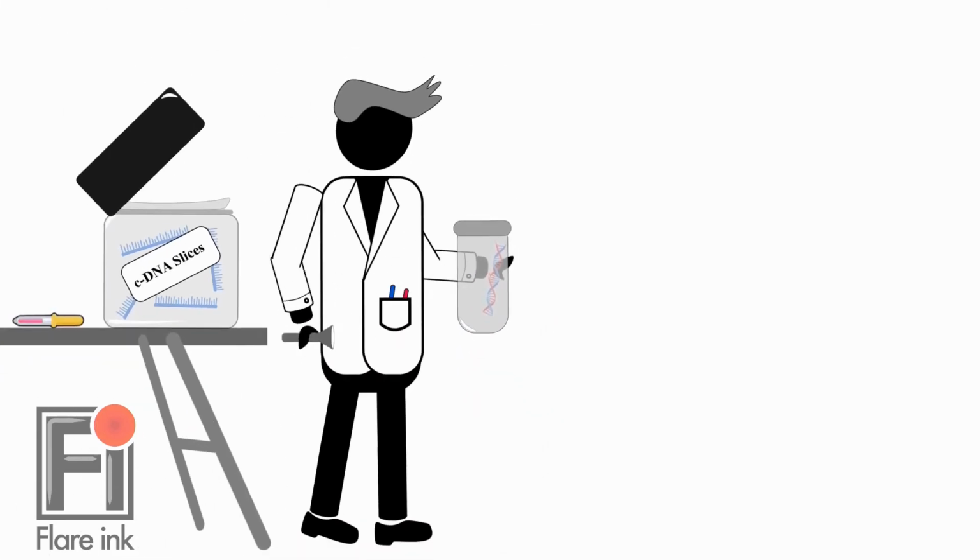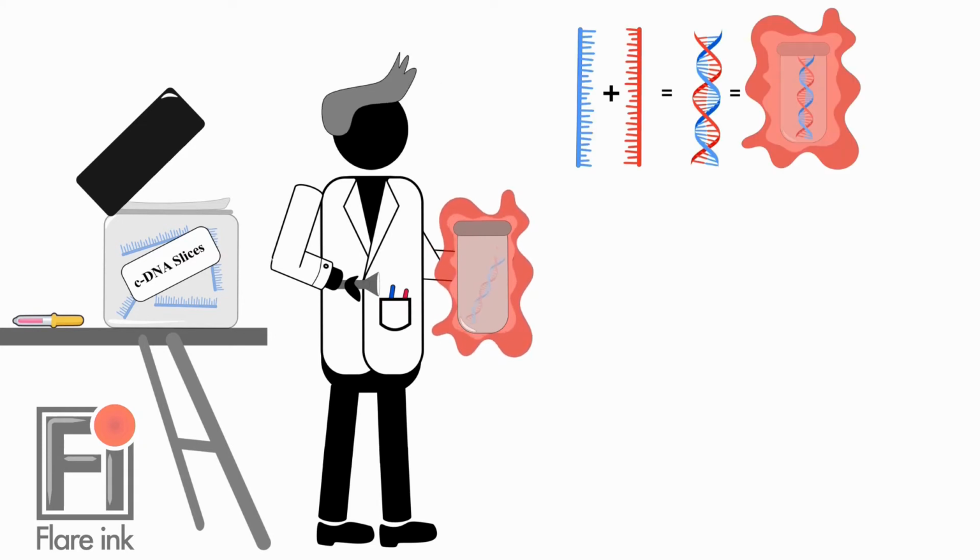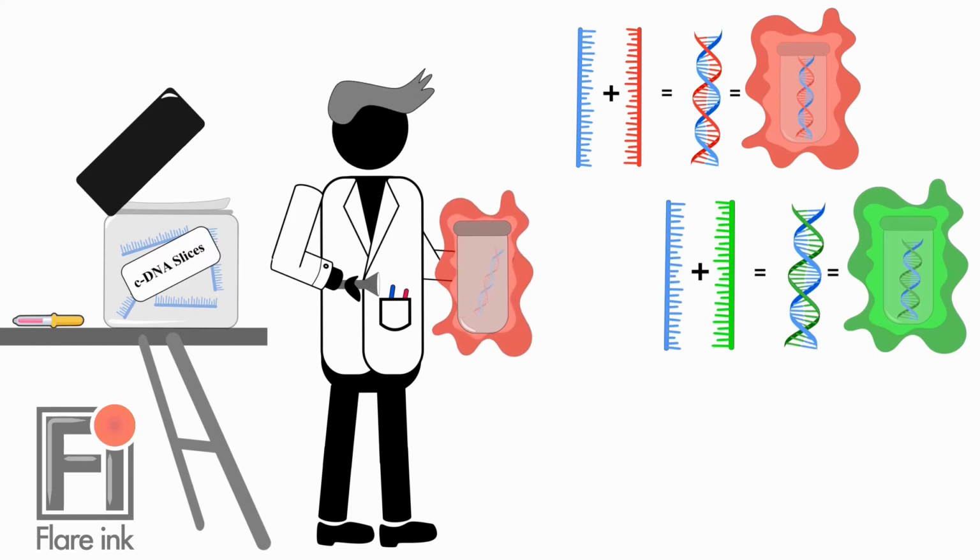Using standard detection technique, we check which of our sample has expressed the gene of interest. Since our samples are fluorescent labeled, they glow when light of appropriate wavelength interacts with them. If our sample responds to red light alone, it means our cancer cell has expressed this particular gene. If our sample responds to green light alone, it means our normal cell has expressed this gene of interest.